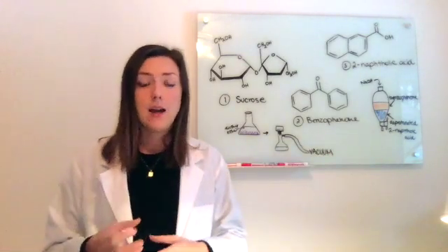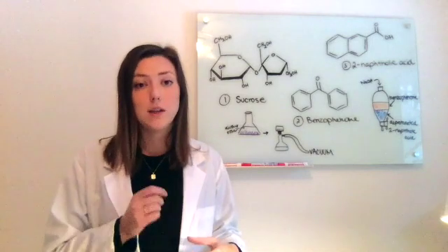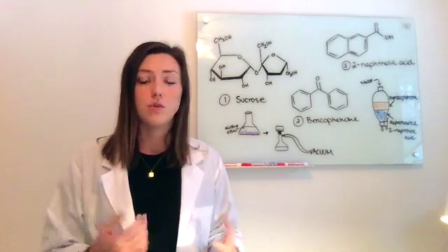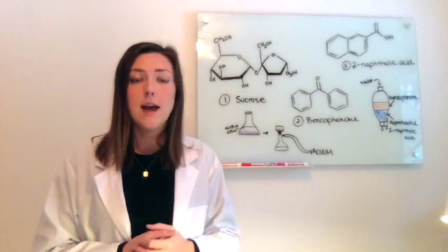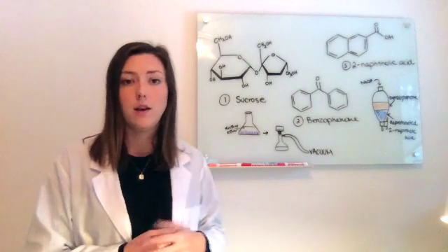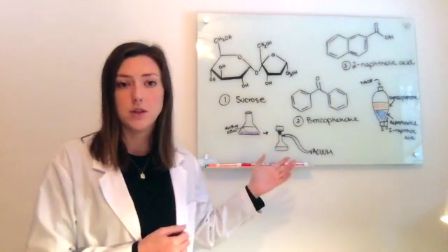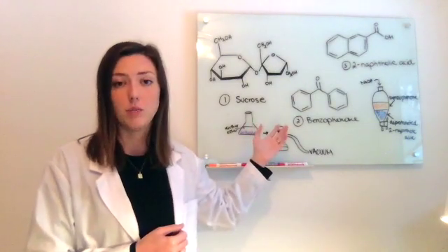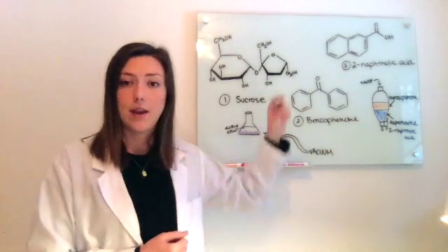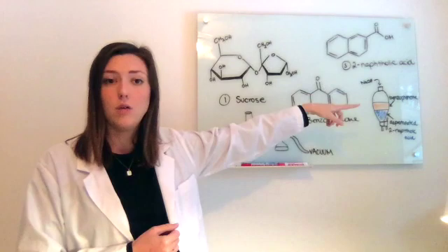I would put it on some ice and reacidify it dropwise using some HCl, just in order to allow the product to crash out of solution. Then I would treat it the same way that I did with the sucrose, where I have a solid in a liquid and put it through a suction filtration system, which allows me to isolate my solid product in the funnel. The last thing I'm left with here is the organic layer containing the benzophenone.